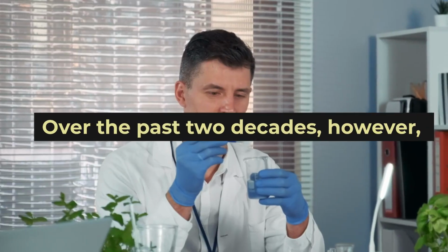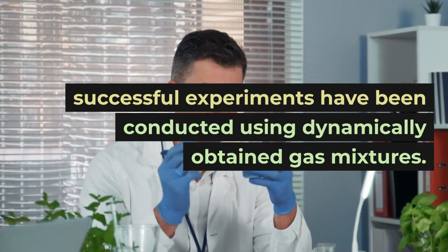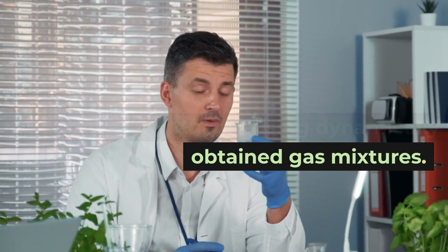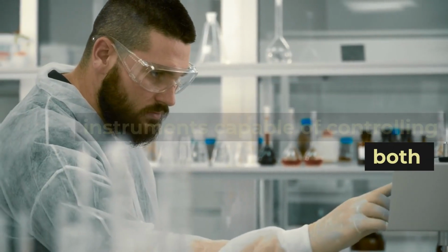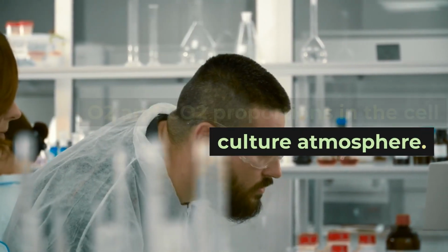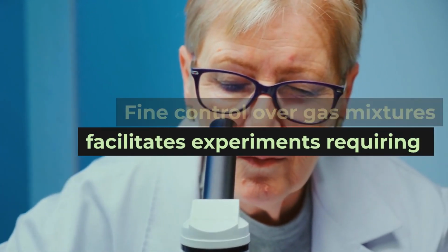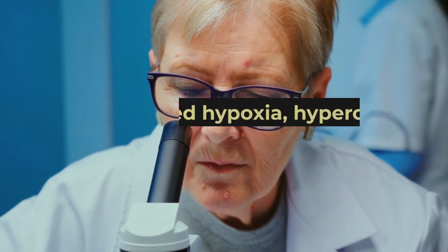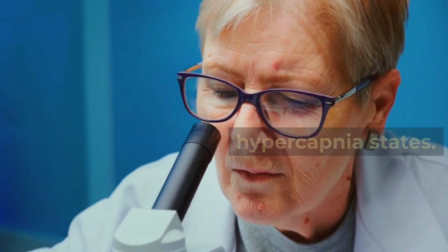Over the past 2 decades, however, successful experiments have been conducted using dynamically obtained gas mixtures. There is an increasing demand for instruments capable of controlling both O2 and CO2 proportions in the cell culture atmosphere. Fine control over gas mixtures facilitates experiments requiring induced hypoxia, hyperoxia, or hypercapnia states.